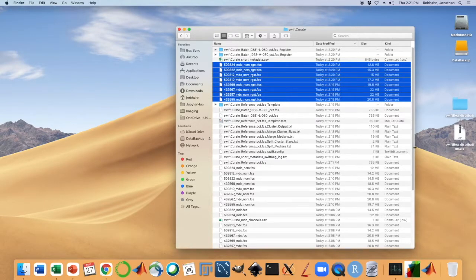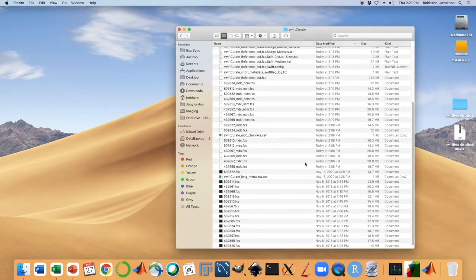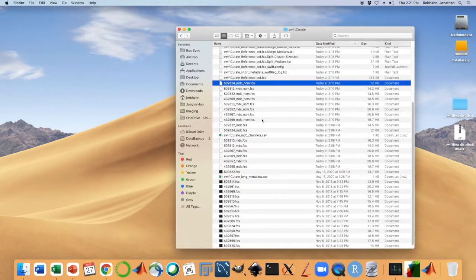And also note that the two interventions that we've performed, these extra pre-processing steps, there's evidence of those working properly. Recall that the samples had modified channel names. That's indicated by the MDC. And then we added new compensation matrices to each of these files so we could kind of harmonize the compensation matrix across all of the different files.